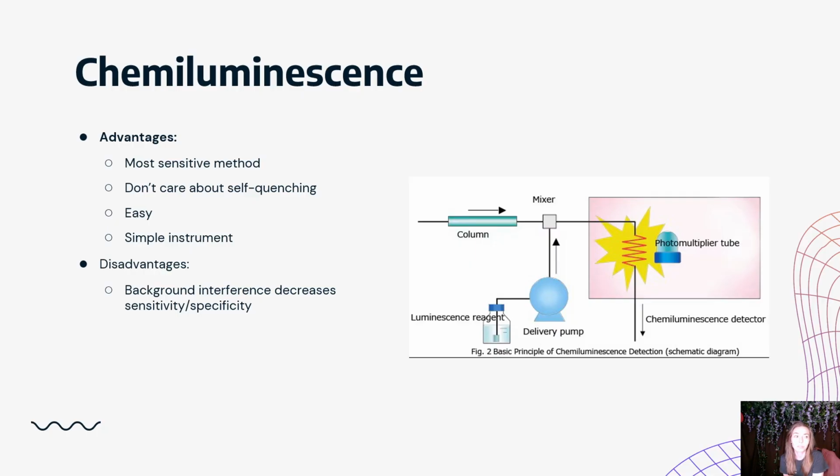Disadvantages of it, though. We're sensitive crybaby. You put anything that interferes with that background, with that zeroed out black background into this system, you get any sort of light contamination, you get any sort of energy contamination, it's going to decrease the sensitivity and specificity of this instrument, which is not fun.